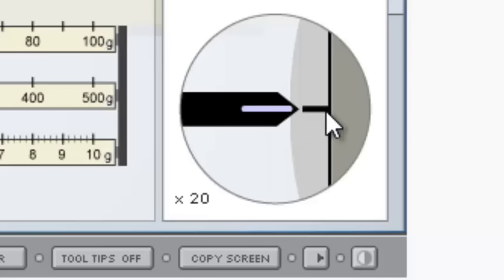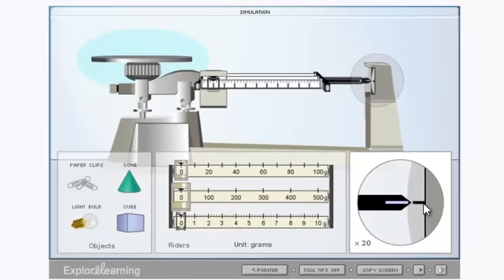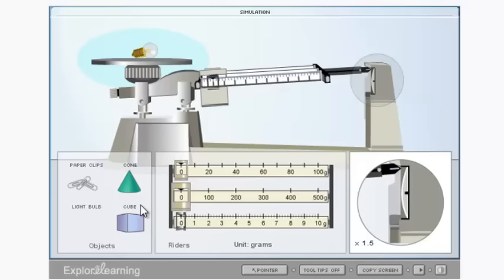A balance is basically a miniature version of the scale in the nurse's office. You step on it and then the nurse is going to move the mass on over until it balances out and there's your weight. So what I'm going to do now is take the light bulb and place it on the pan. Now that we have the light bulb on the pan you can see that there's an imbalance here. Things are unequal. I have mass over here but nothing to even it out. So the pointer has shot all the way to the top.